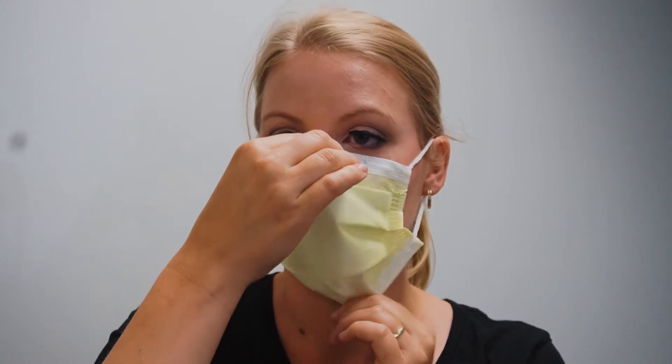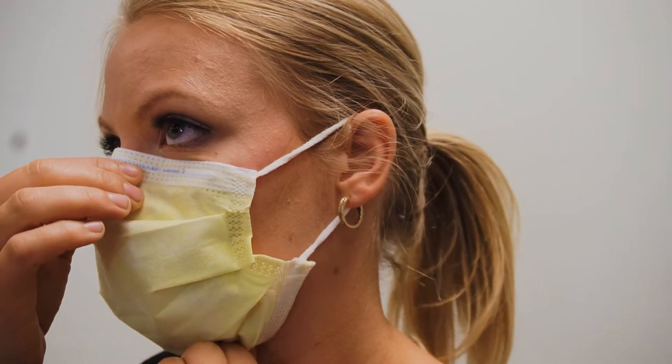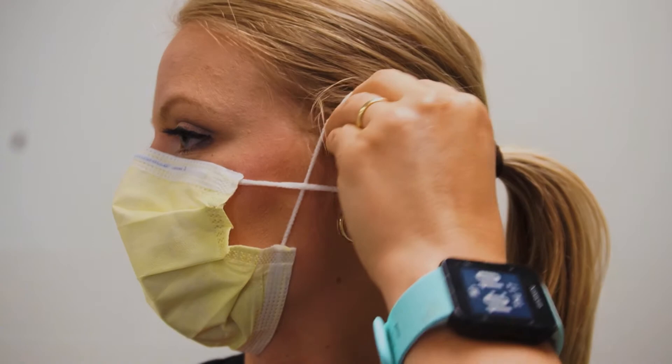Hold the mask in place and pull down under your chin for a correct fit. Adjust the mask so it fits comfortably and properly. You may have to adjust your loops and ties depending on the shape of your face.